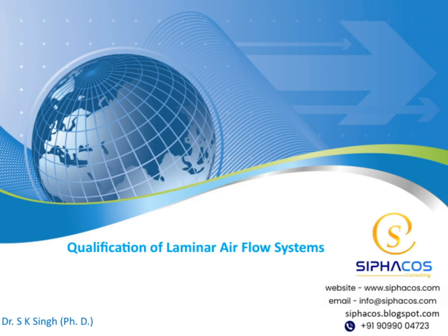Today, we will be discussing the qualifications of laminar airflow systems. I'm excited to share insights on this important topic with you. In this session, we'll cover the basics of laminar airflow, its design principles, and the key qualifications that ensure these systems operate effectively. Let's get started and explore this fascinating area together.